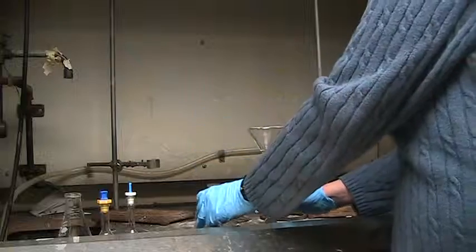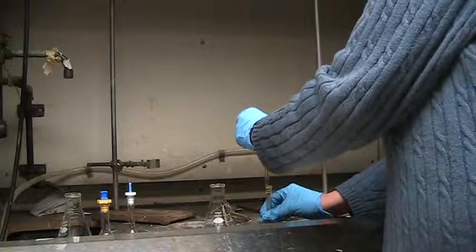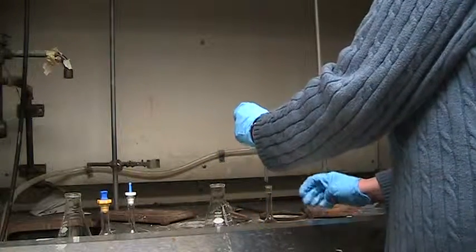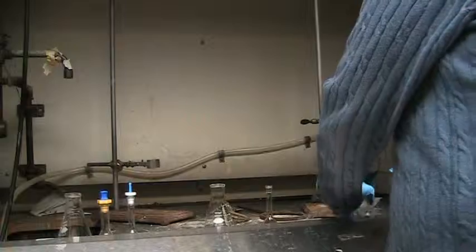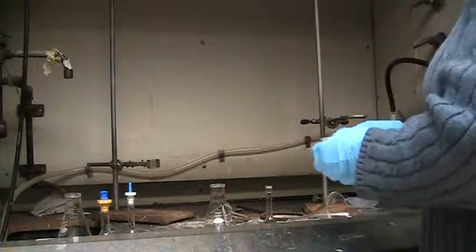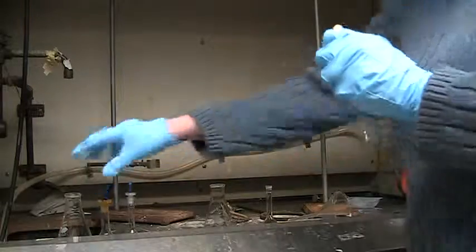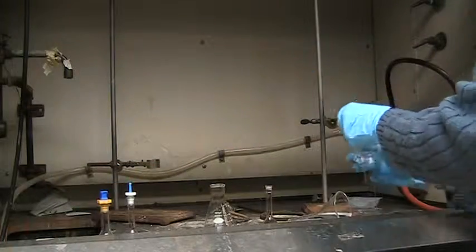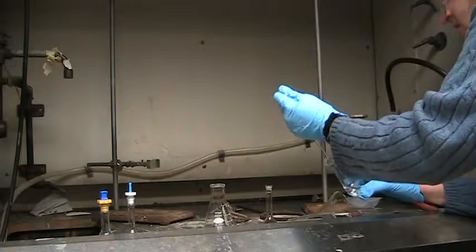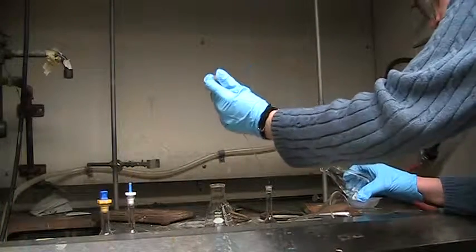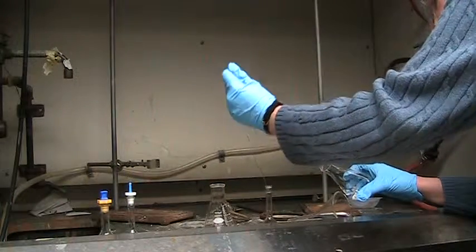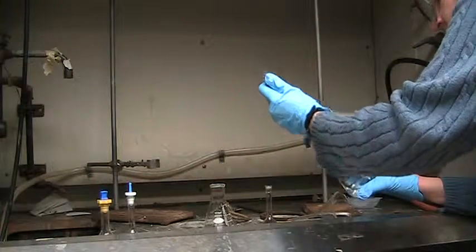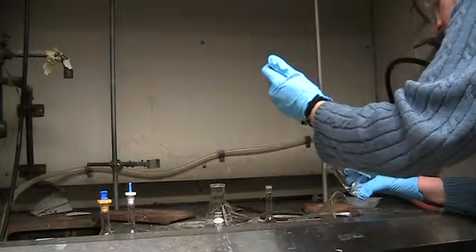At this point I want to fill the volumetric flask to the mark with the solvent that we are using for the dilution. In this case it's dichloromethane. So using the pipette I can start by filling it relatively quickly as I start to approach the mark.